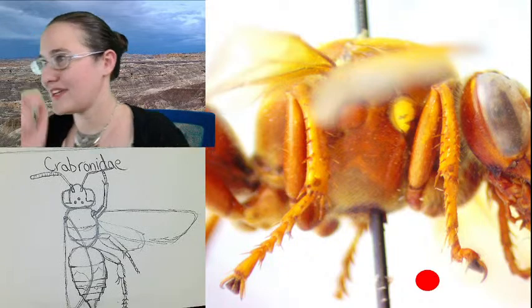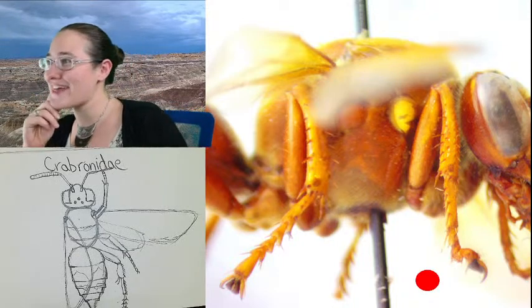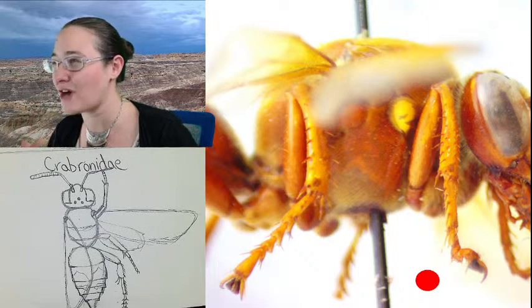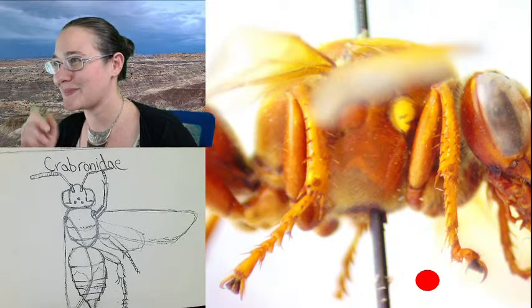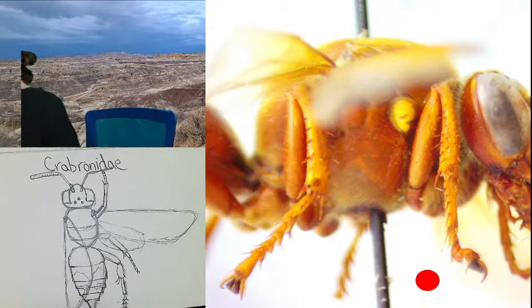Okay. I figured out what I was thinking about. I was thinking about the identification for Sphecids, which is that this little bump here doesn't touch the tegula, which is the shoulder blade, that there's space in between it. But that's the same for both Sphecids and Crabronids, so it's not really an identifying characteristic anymore, because they separate it.